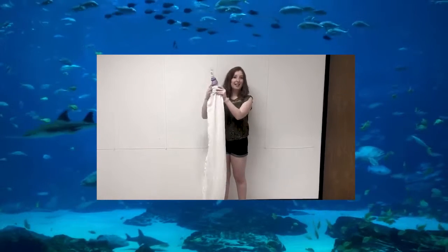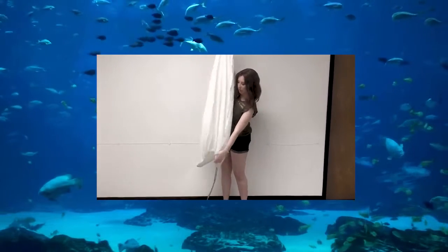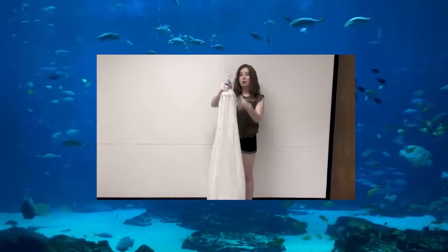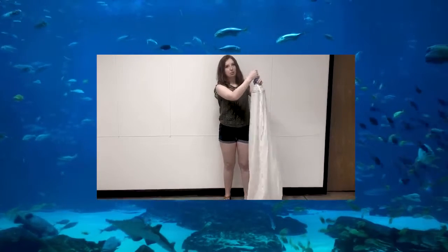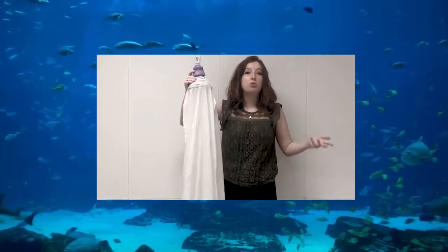So this is what scientists actually use out in the wild to capture coral eggs and bring them into the lab. What they do is they will place this over the coral. Then this will be used like a vacuum to suck up the coral, and the coral eggs will be inside this little test tube right here. This is how they collect the coral eggs to experiment on them and to make them adapt to the acidification of the ocean later on.